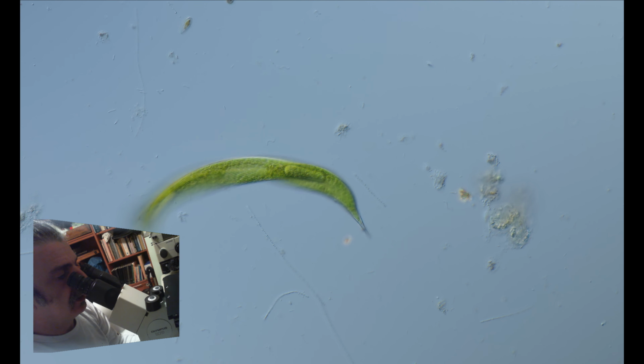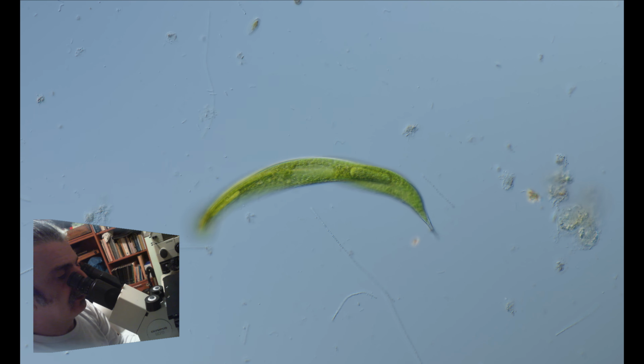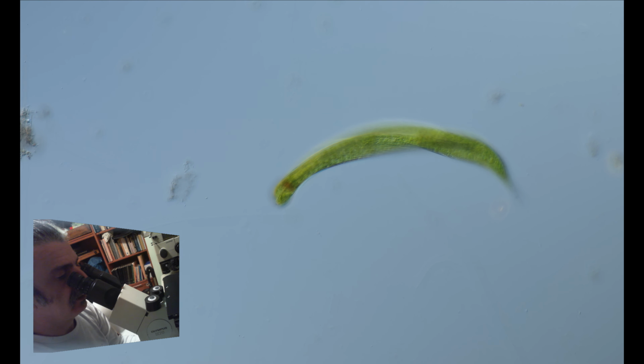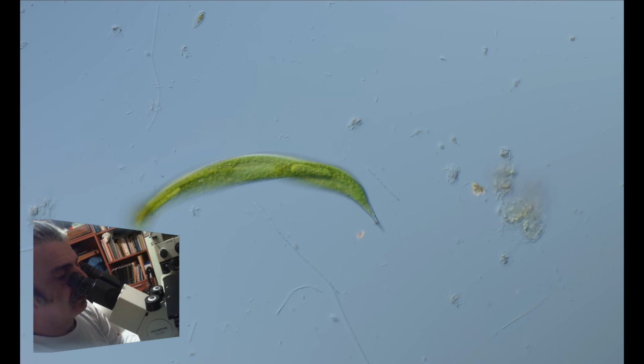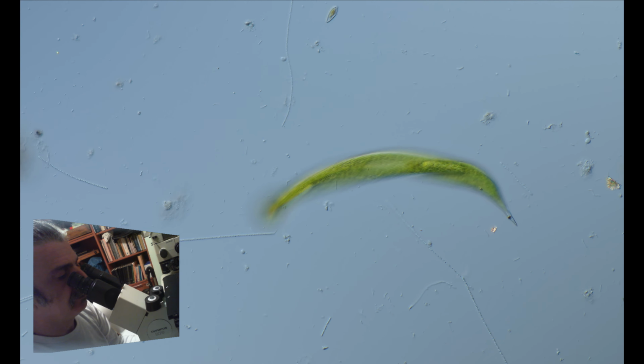You can see in its middle rectangular shapes, which are deposits of starch that it preserves for later use. It's called paramylon. It's a kind of starch compound. What happened here? That's better.